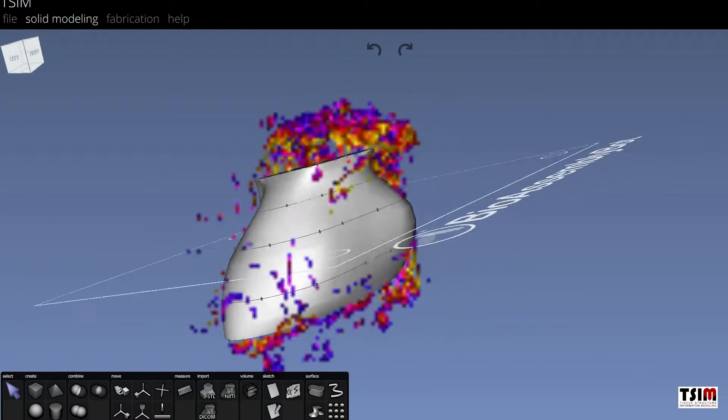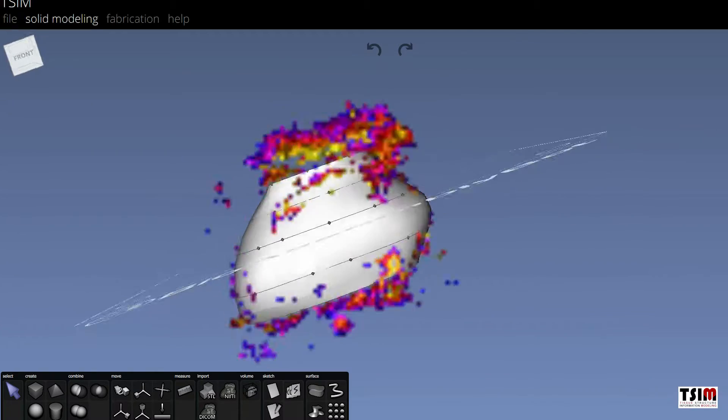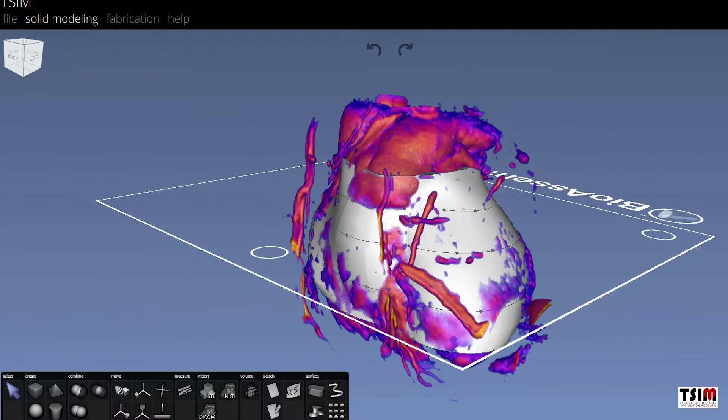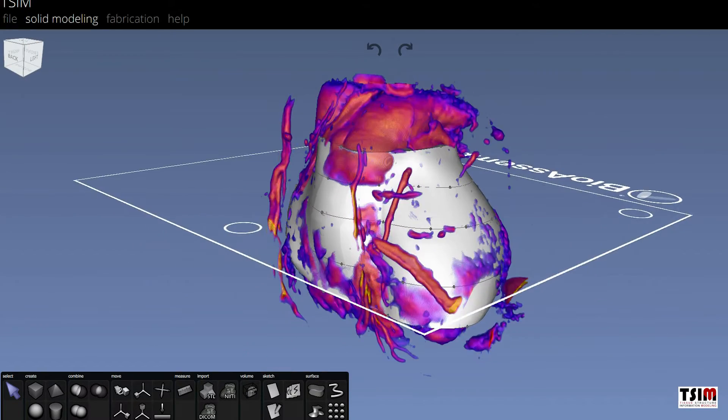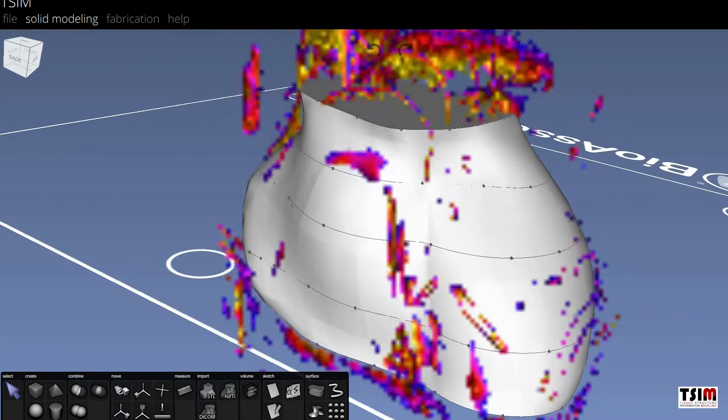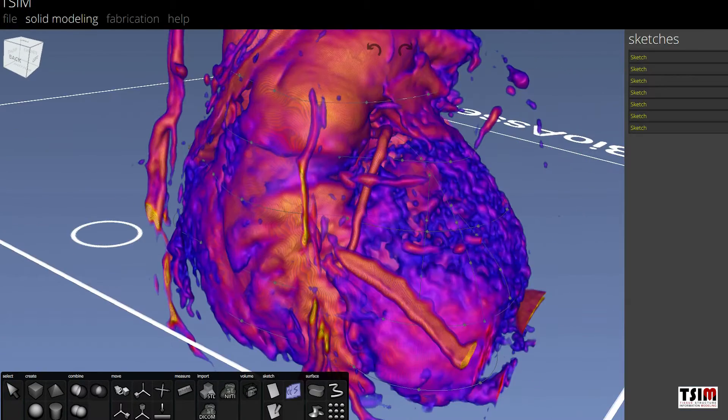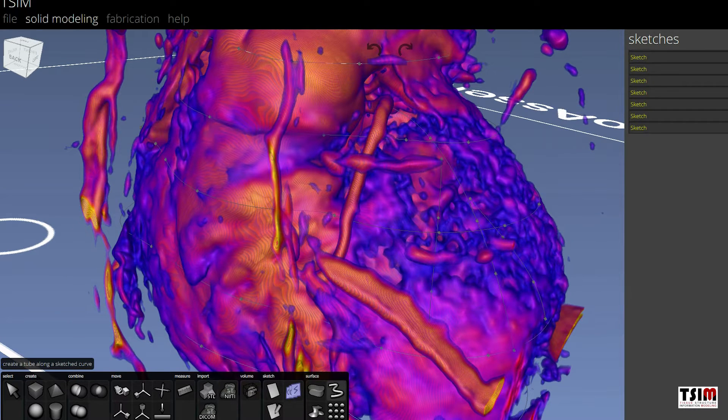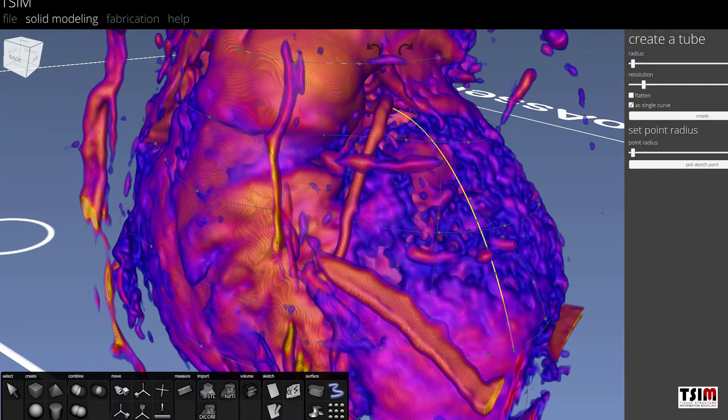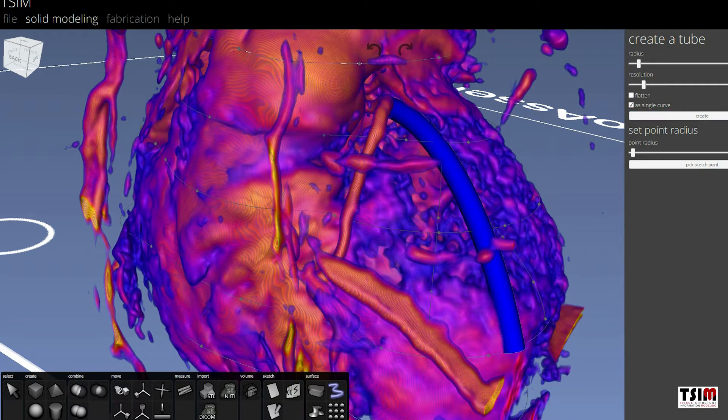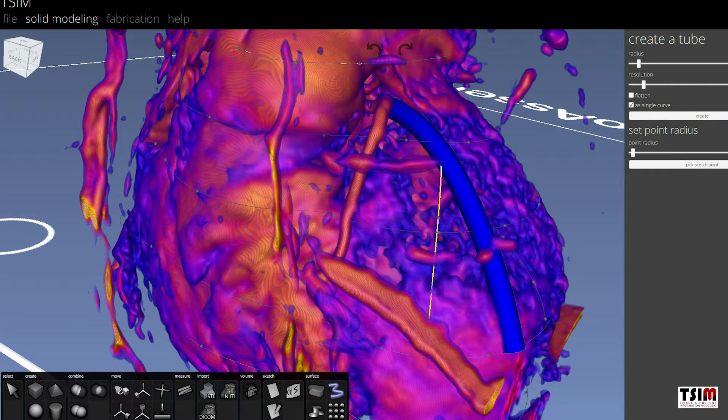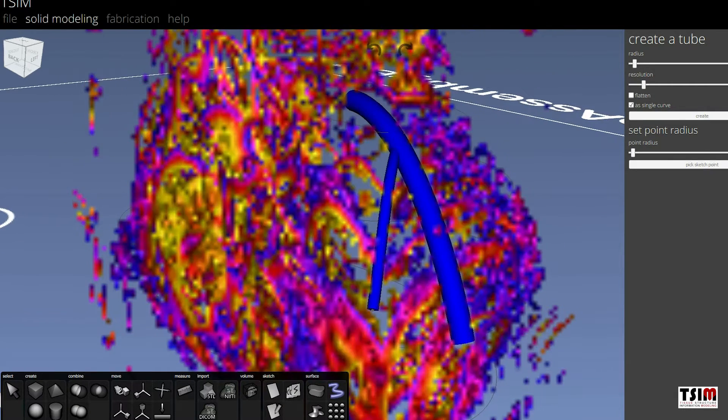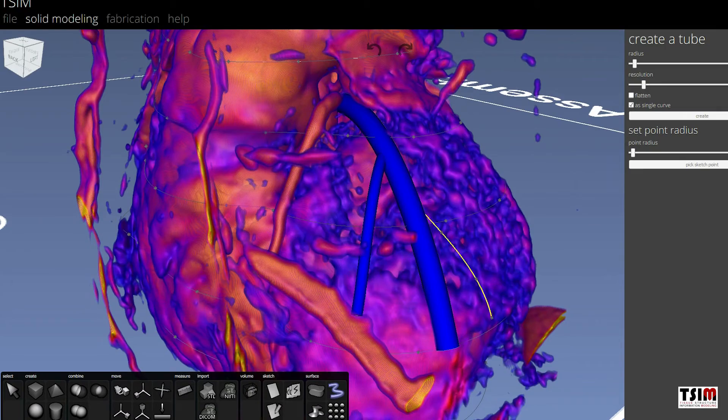Once that model is created, the technician can manipulate and model the computer version of the patient's heart to be able to make particular selections, identify key structures, and in this example, place the new blood vessels on the surface of the heart.